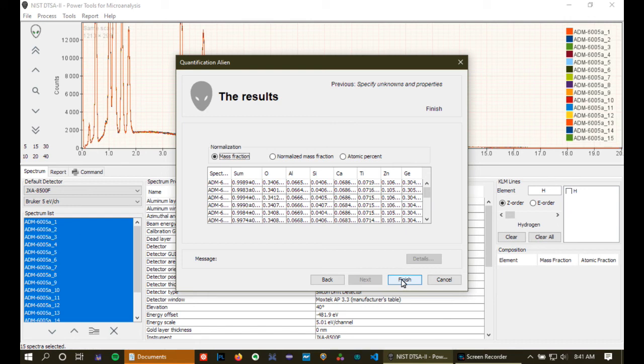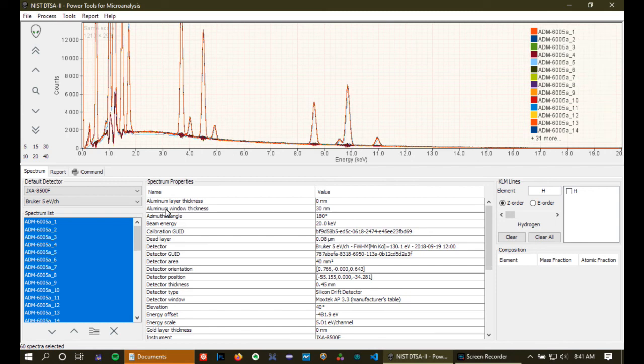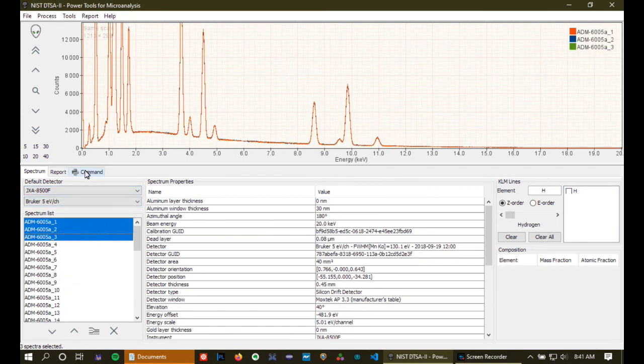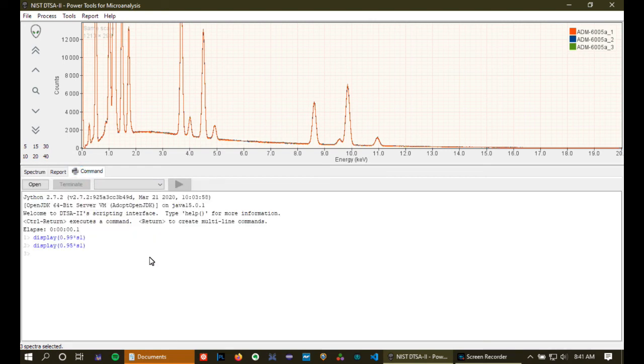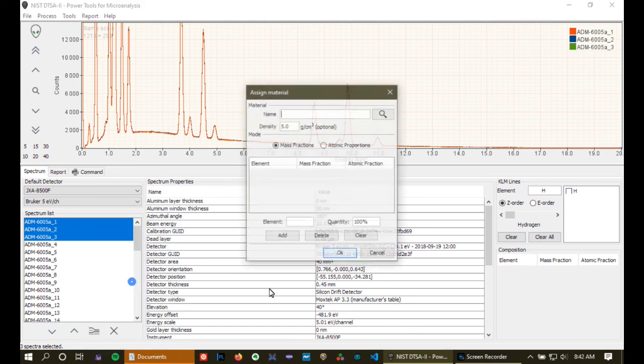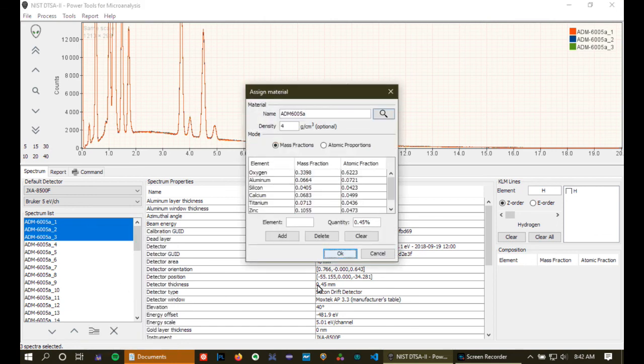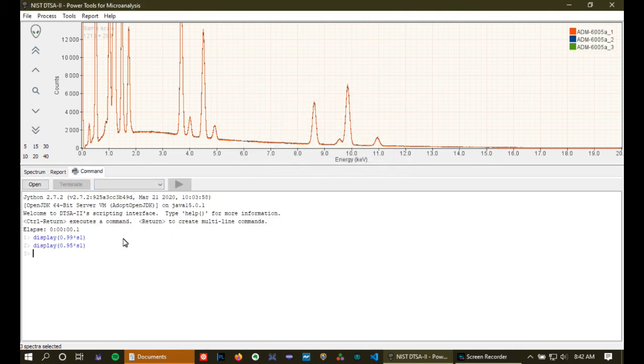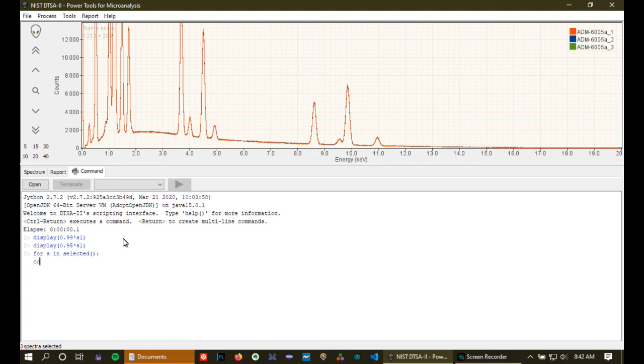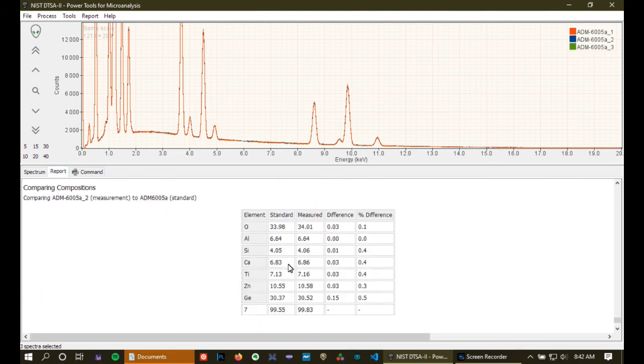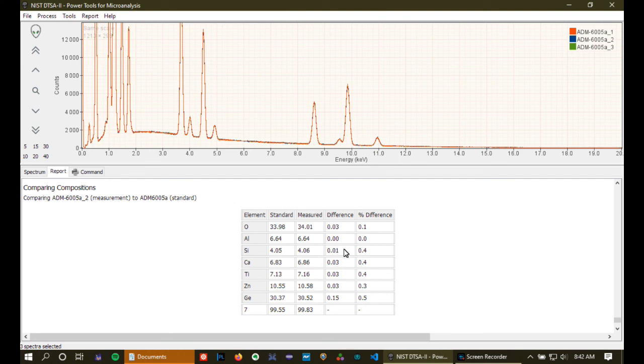So, we'll finish up, and then we'll look at a couple last things. One of them, we're just going to use a little scripting magic again to see how these results actually compare to the known composition. So, the first thing I'm going to do is I'm going to assign the known composition to that material, which ADM-6005a is the known composition. Okay. And then I'm going to go to the command line. And for S in the selected spectra, that's these three selected spectra that you see above, we're going to use the compare function to compare the known composition to the measured composition. And its output is a table like this.